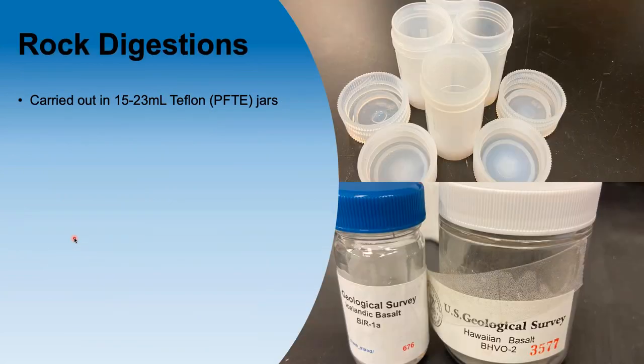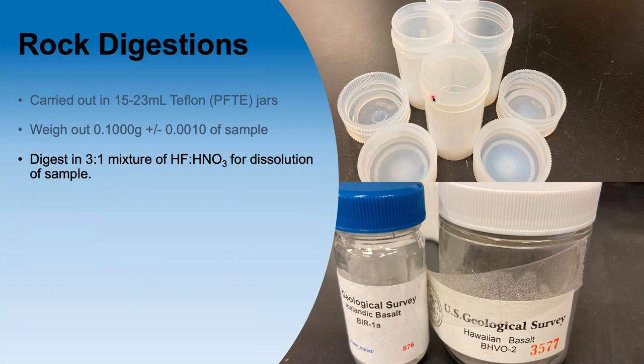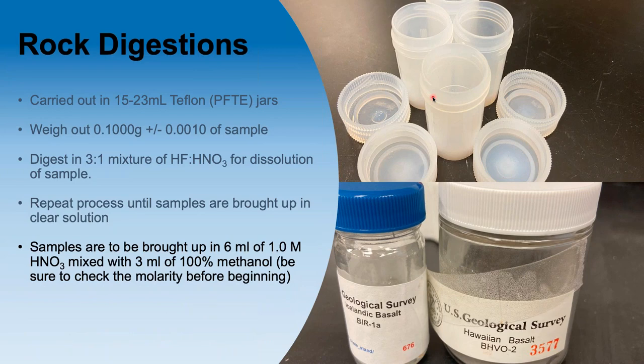Really important, we need some sort of digestion. We did our rock digestion in PFTE, the Teflon jars, and we weighed out very precisely. We digested the rock samples in a mixture of hydrofluoric and nitric acid. Nasty stuff. If you don't need to use it in your lab, please don't. For rocks, it's the only thing that breaks those silicon bonds. And we repeat this until we get a nice clear solution so we know we've killed everything. And then we bring the sample up in 6 milliliters of 1 molar nitric and 3 milliliters of methanol.